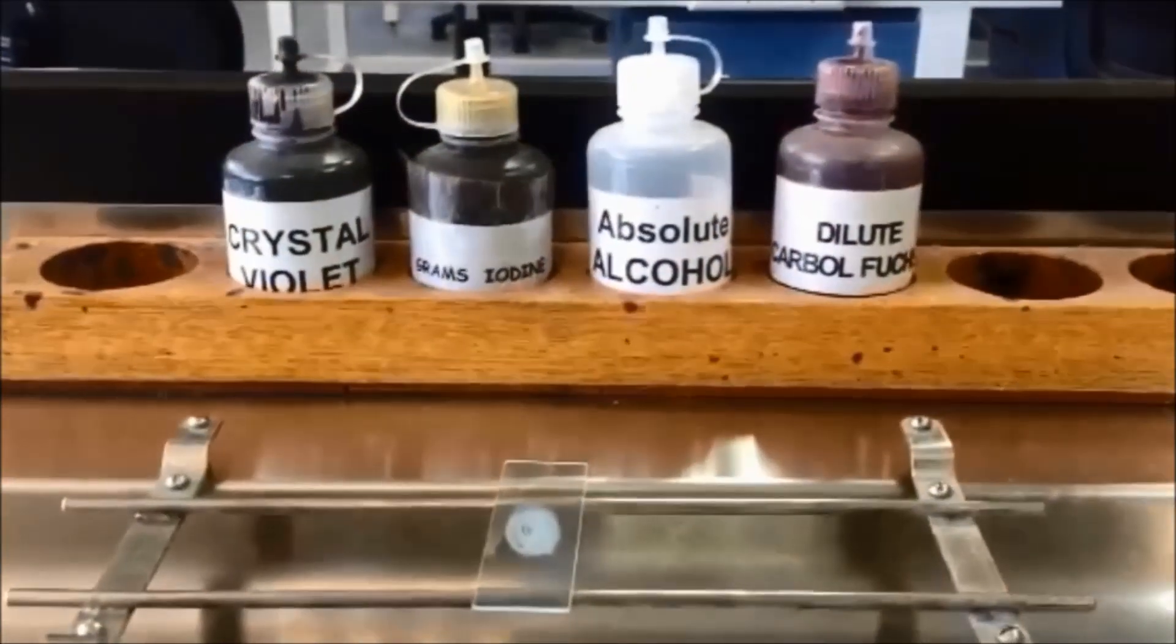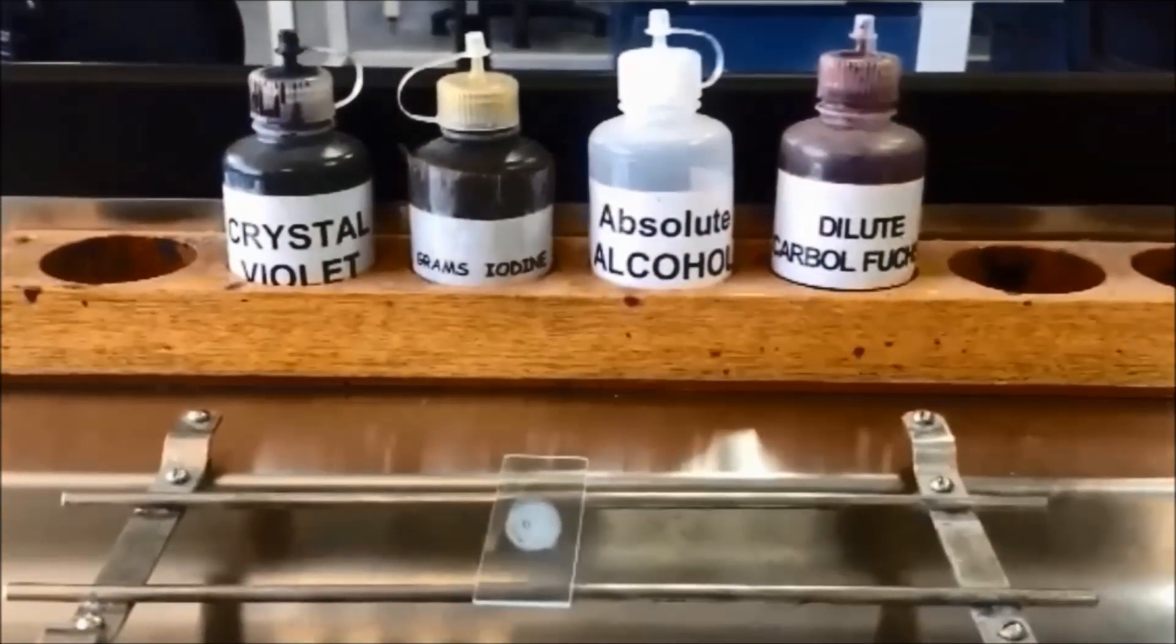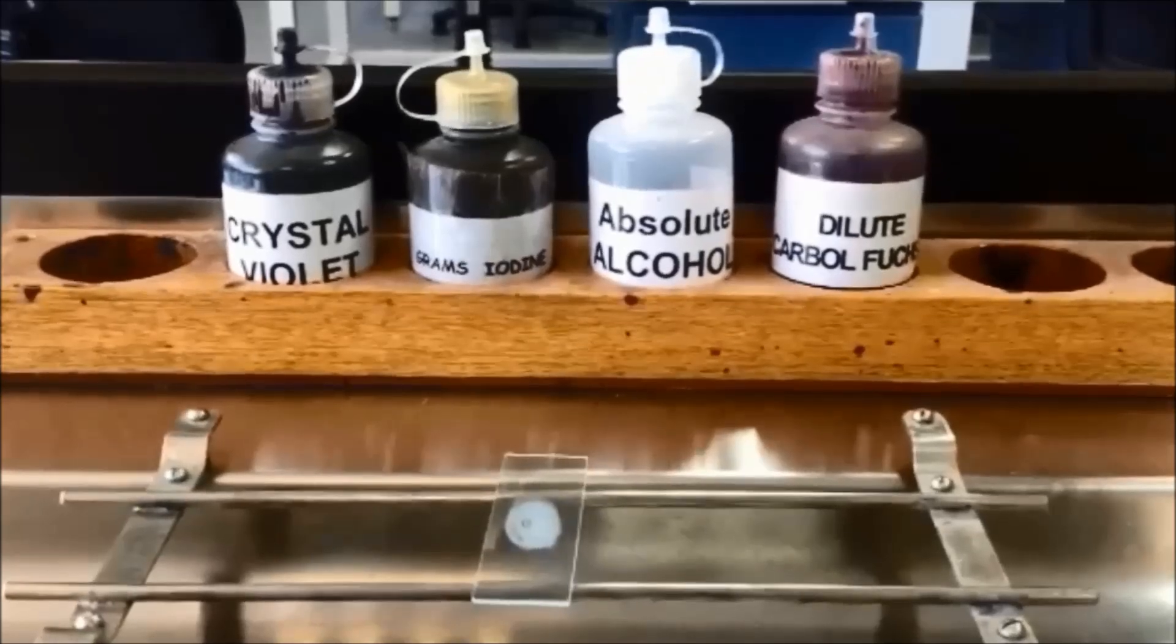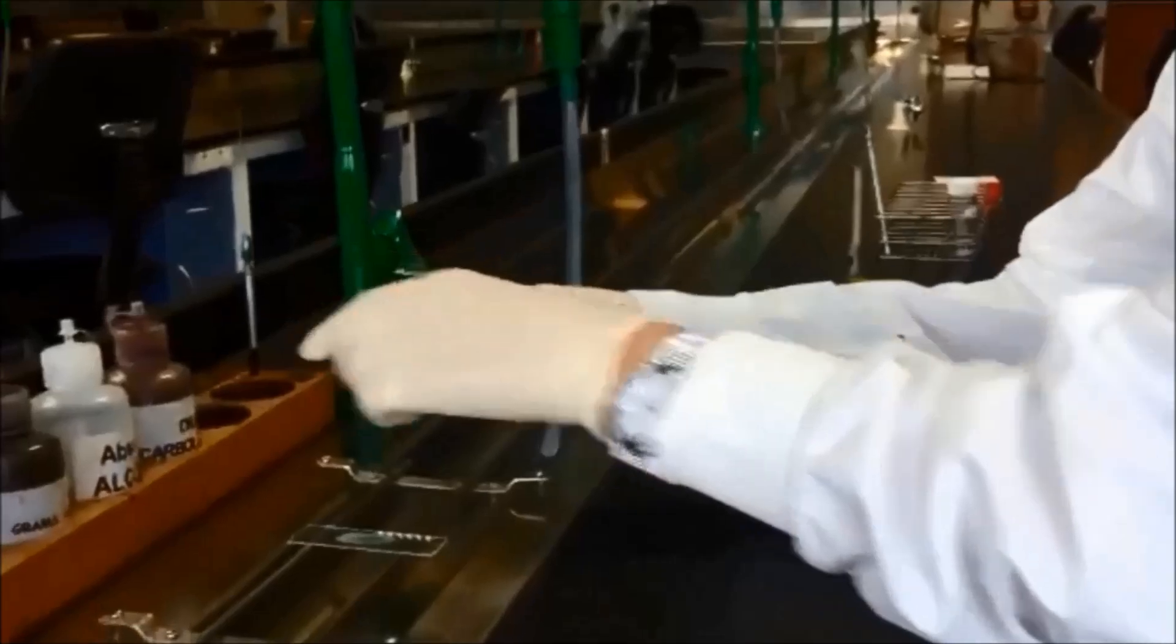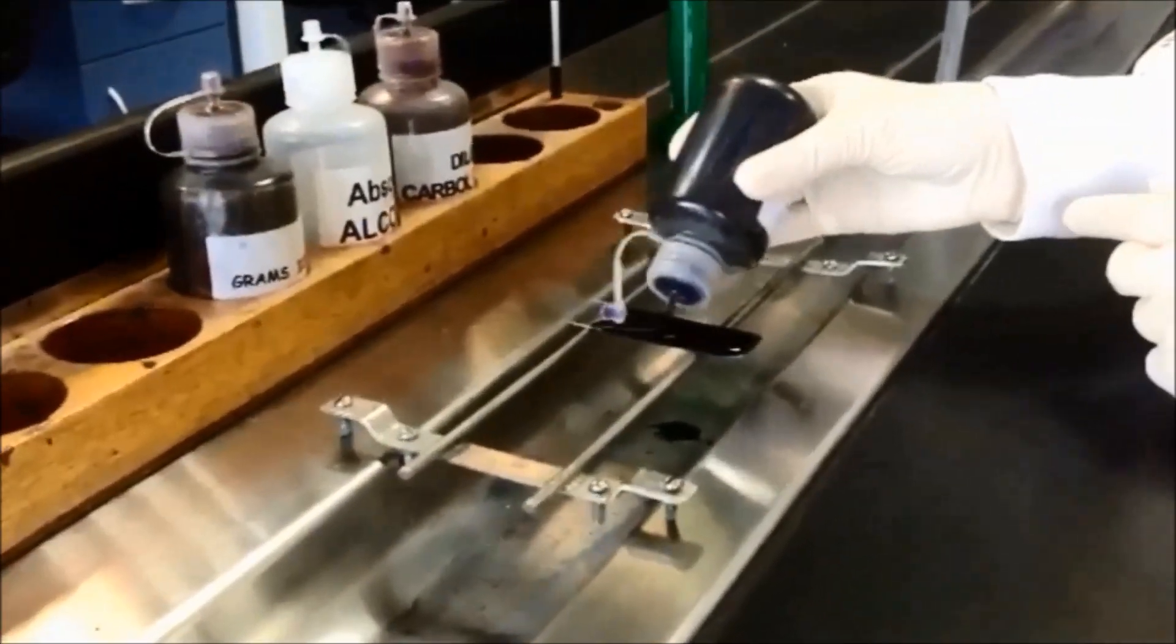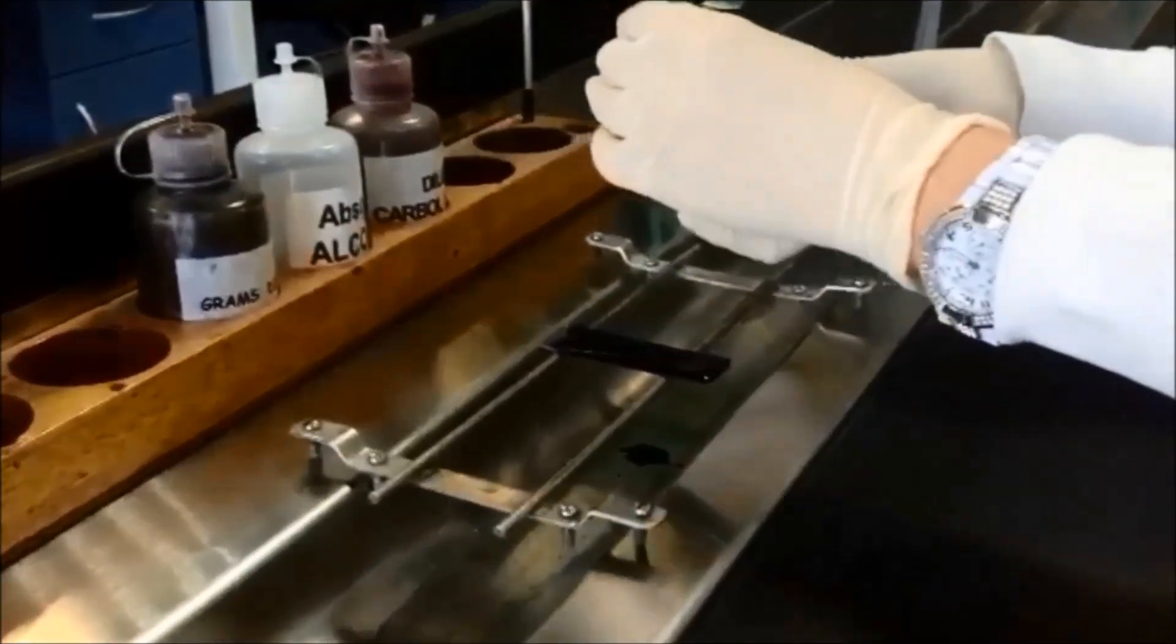The Gram staining reagents include Crystal Violet, Gram's Iodine Solution, Absolute Alcohol, and Dilute Carbolfuchsin. Wear gloves to avoid getting stain on your fingers. Stain with Crystal Violet first by flooding the slide. Leave for 30 seconds.